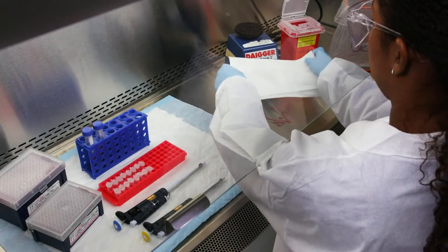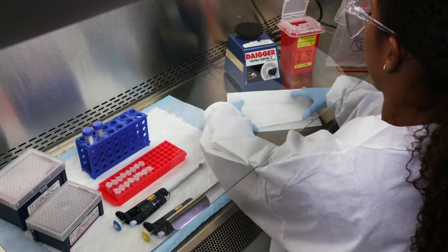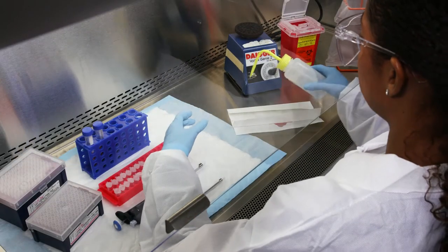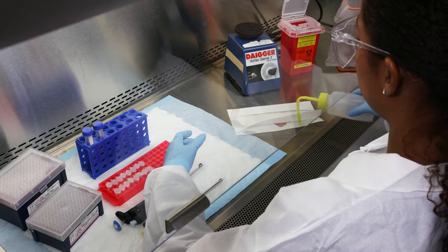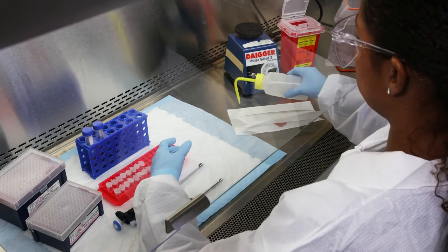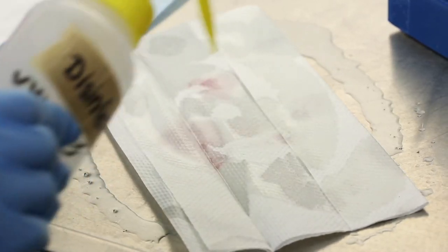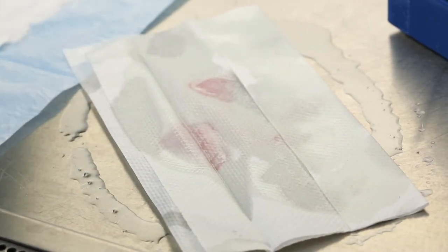The first thing you should do is cover the spill with an absorbent material such as paper towels. Using a plastic squirt bottle, carefully apply the designated liquid disinfectant in your SOP to the absorbent, starting at the outside of the spill and moving toward the center in circular motions.